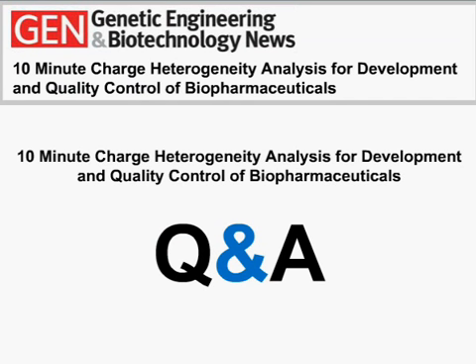And Scott, what is the highest pI that can be used with ICE and still have good resolution, reproducibility, et cetera? Typically, the limitation is usually the cathodic blocker. The isoelectric point for arginine is somewhere around 10.7. So you can use the 8 to 10.5 to get good resolution out to about 10.5. If further is needed, you can use the 9 to 11 Servolyte with TEMED. Typically I will use about 2% or less of the Servolyte just due to the background noise, and between 5 and 10 millimolar of the TEMED.